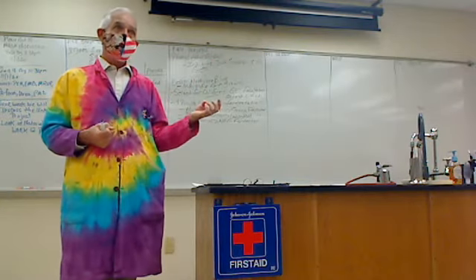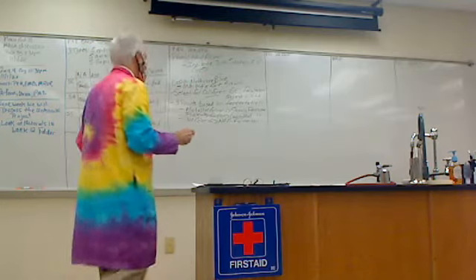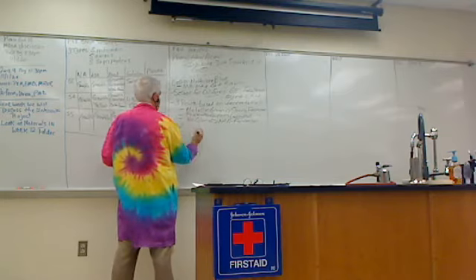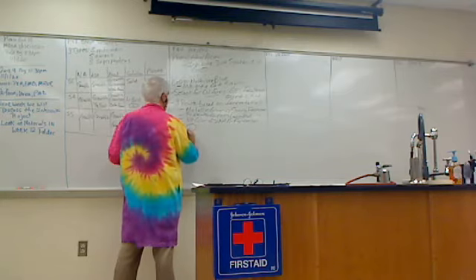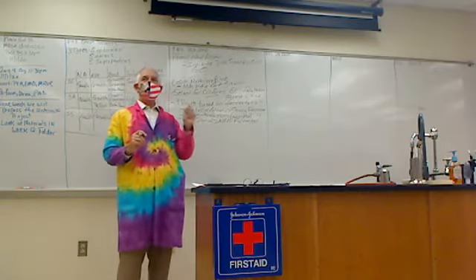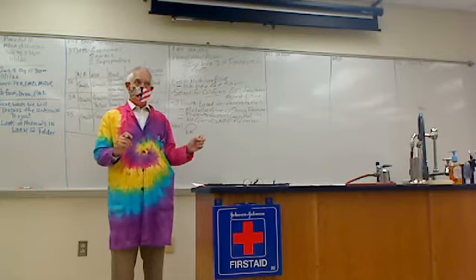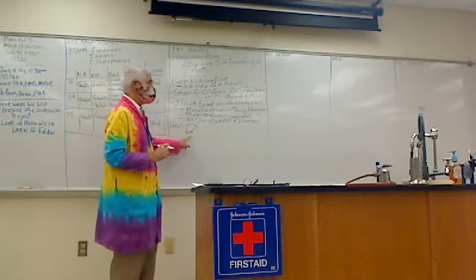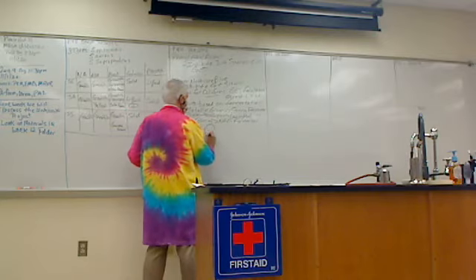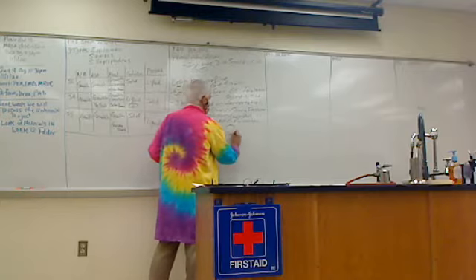Today's date, and it's going to be 37 degrees C. So, you'll label an NA plate. So we need to verify, class, that your bacteria is alive. So you're going to label an NA plate, a PEA plate, and an EMB plate.